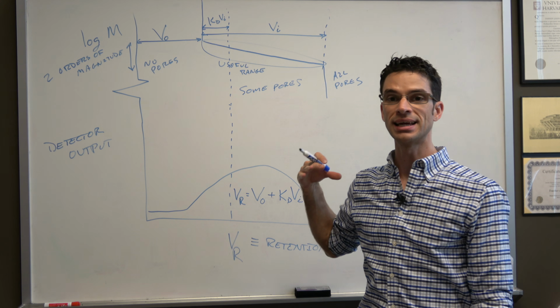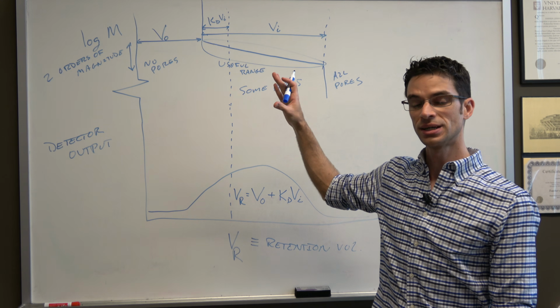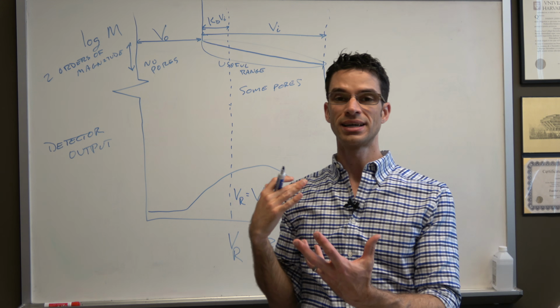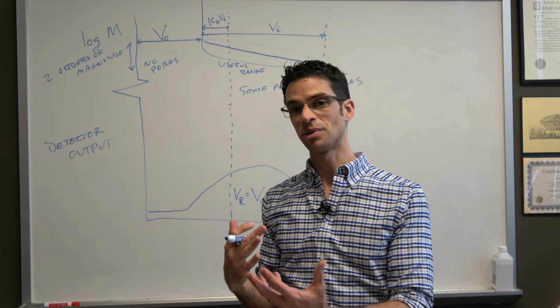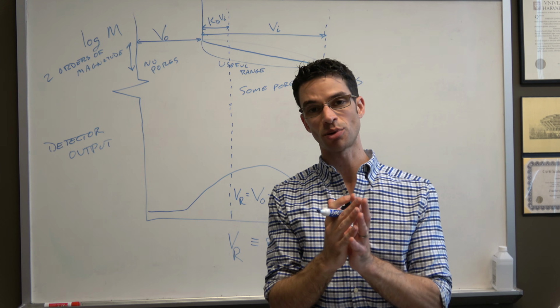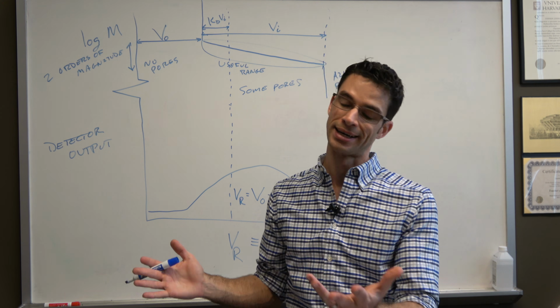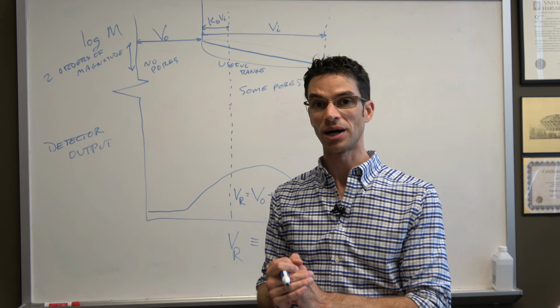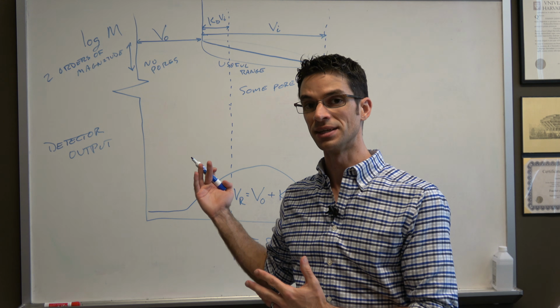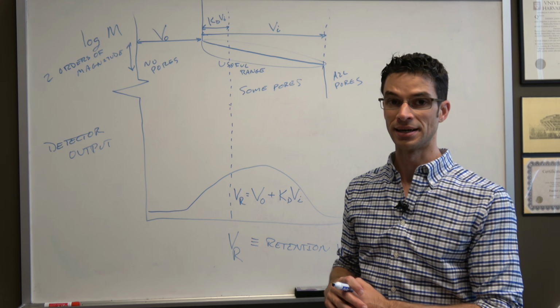Then we take a system of unknown molecular weight and we run it through the system again, and we assume that if the hydrodynamic volume has the same dependence on molecular weight as for our standards, and if we chose our standards properly, this is a pretty good assumption, but there are caveats which we'll talk about. Then we can assume that the molecular weight of the unknown sample is the same as the molecular weight of the standard.